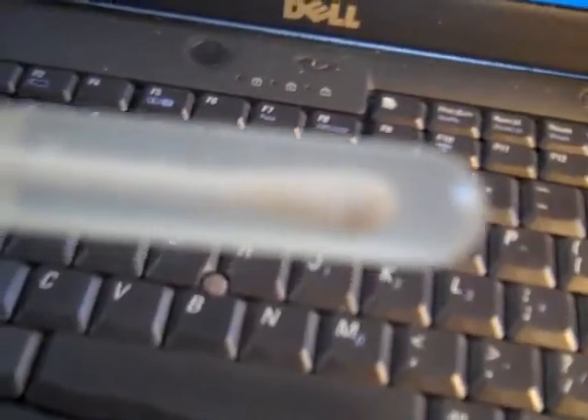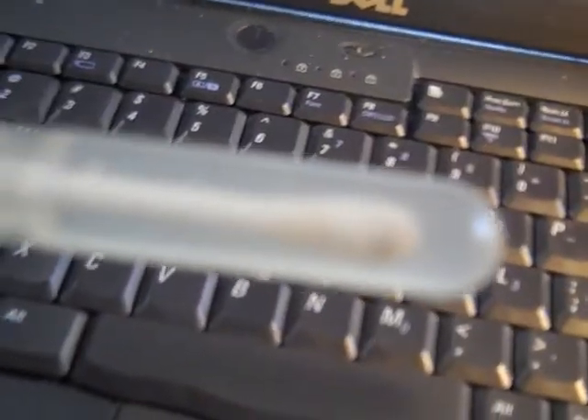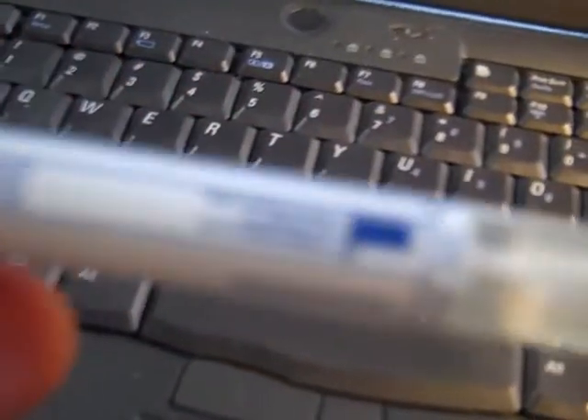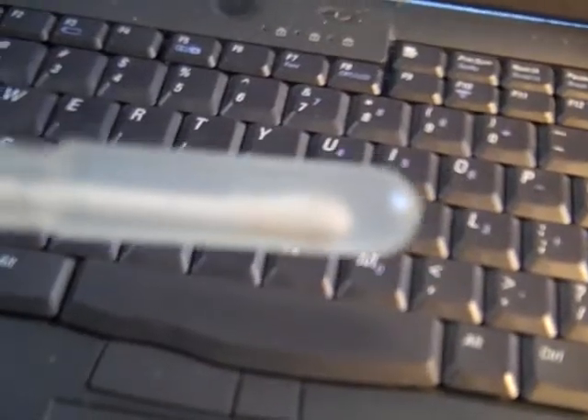Right now I have this culture tube — you can hear the fan. What you do is smear something on it and put it in this jelly, and then it'll grow the bacteria or fungi. We're going to be sending this in to see what the brown stuff is.